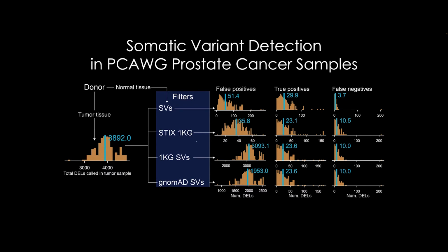So while adding samples can help the false negative issue, I argue that we can't outgrow our databases to account for the false negatives. Interestingly, the true positives are fairly consistent for all methods, but you must consider that these true positives are mixed in with the false positives, making them hard to identify in the population level filters.